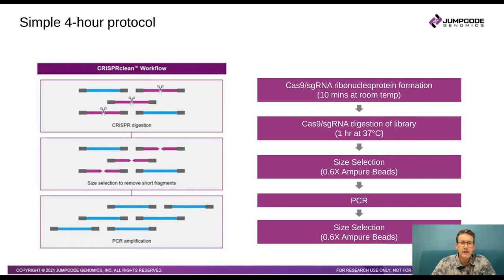We can use Cas9 and guide RNAs complexed in an RNP and then digest those library fragments that the guide RNAs are designed to target.